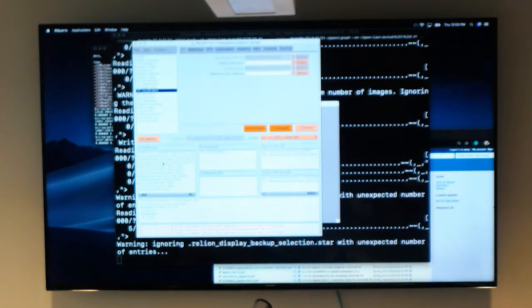After classification, I then selected one particular class and I ran a 3D refinement job. There are many different outputs. What it'll do is something called gold standard, in the sense that it'll split your data set in half, and it'll compare 2 half maps to each other to determine a similarity. And in this case, these 2 half maps were similar out to 3.7 angstroms.